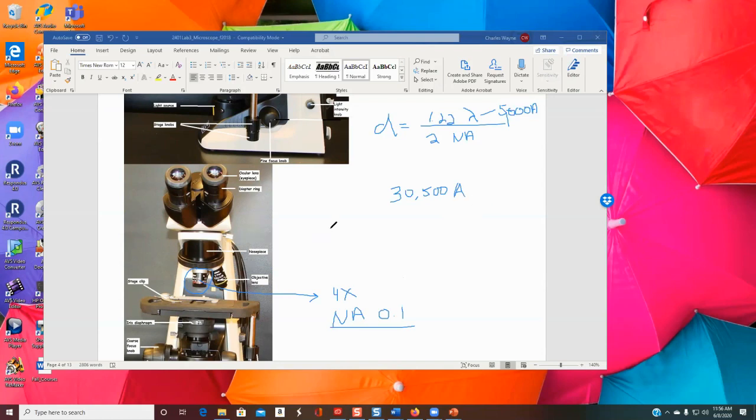And I'm going to, if I can, I don't know how neat I'm going to be, but let me give a shot over here. Let's, 1 millimeter equals 1/1000th of a meter.